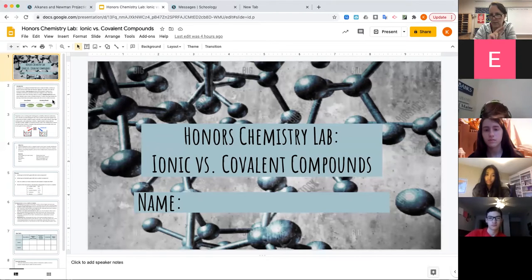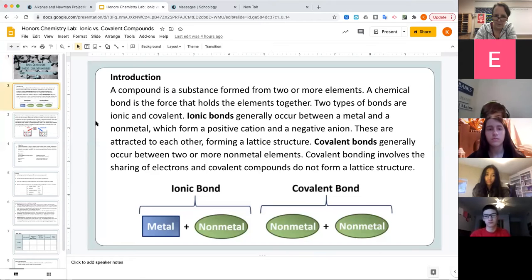One of them is ionic and one of them is covalent. So we're looking at properties. A little bit of an introduction. Ionic compounds have an ionic bond, and they are typically made with a metal and a non-metal. Covalent compounds are covalently bonded together, and they are typically both non-metals. Metalloids are included with non-metals for the purposes of bonding, and we will see that later.